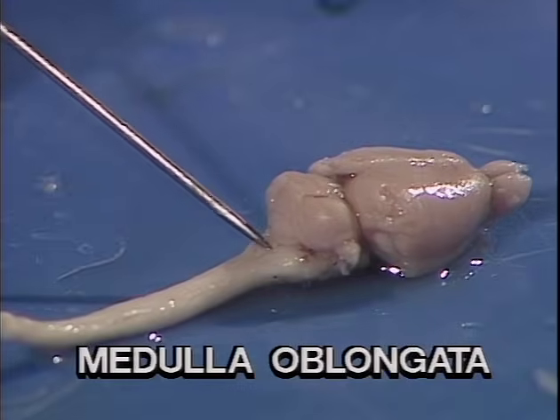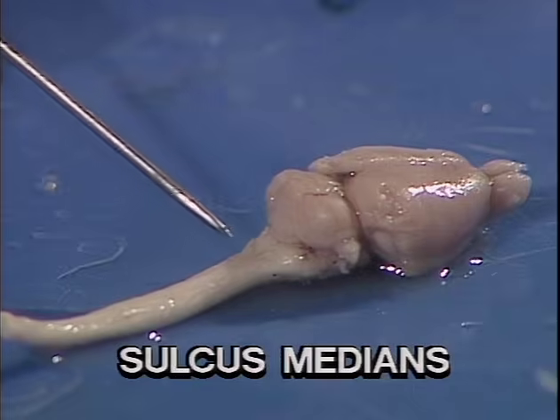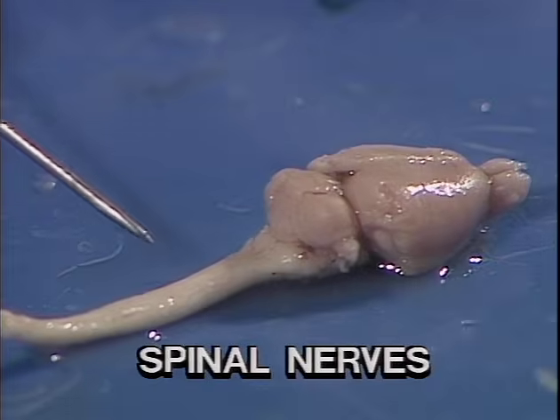It is divided by a deep groove called the sulcus medianus. The spinal cord will continue posteriorly down the vertebral column of the rat. Paired spinal nerves will leave the spinal cord at intervals.